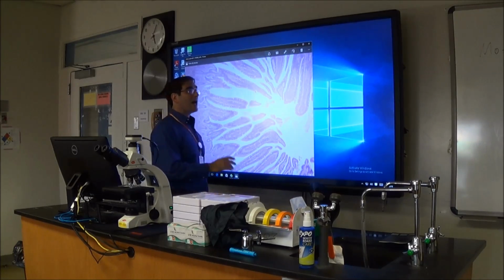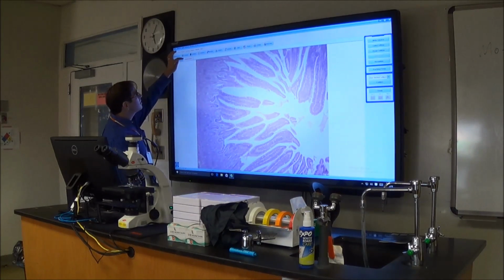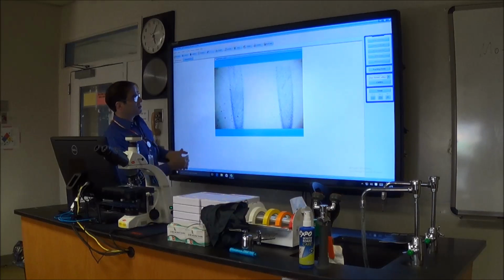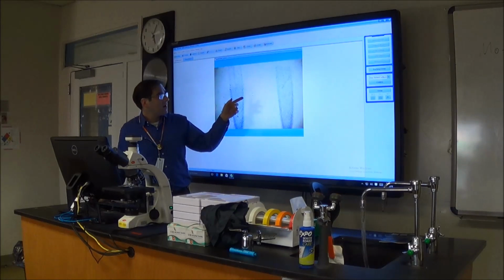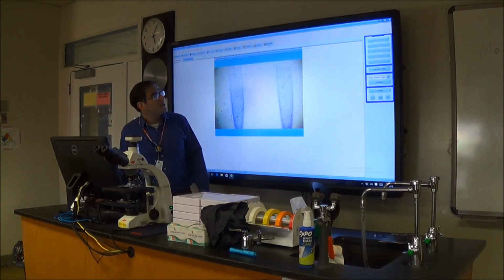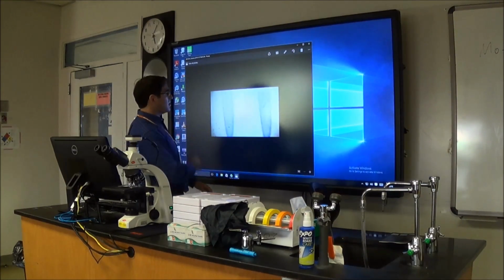It's basically the exact same thing if you want to save one of your student images. So let's go back to our software. Click the tab that says Student Image. Let's go with number 6 here. Microscope number 6. I want to save this image. You do the exact same thing. You put the mouse icon right over the image, right-click, and it gives you similar choices. Capture is one of them. Click Capture and save it where you want to save it. So I'll choose JPEG again. I'll save it on the desktop. And right here, as you can see, there's the image.